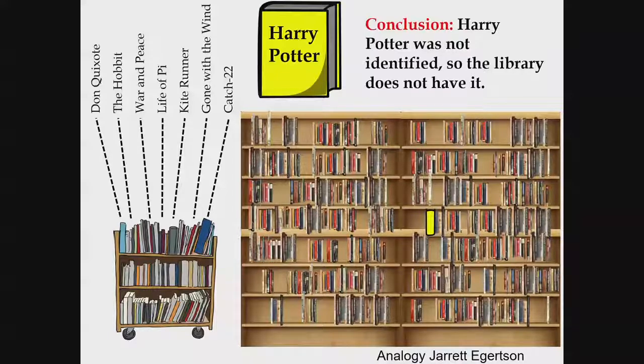You would never think about it this way, which is why just because you don't identify a peptide by data-dependent acquisition doesn't mean anything about whether or not it's present or absent. It only means something if you can identify it. Then you can say it's present.